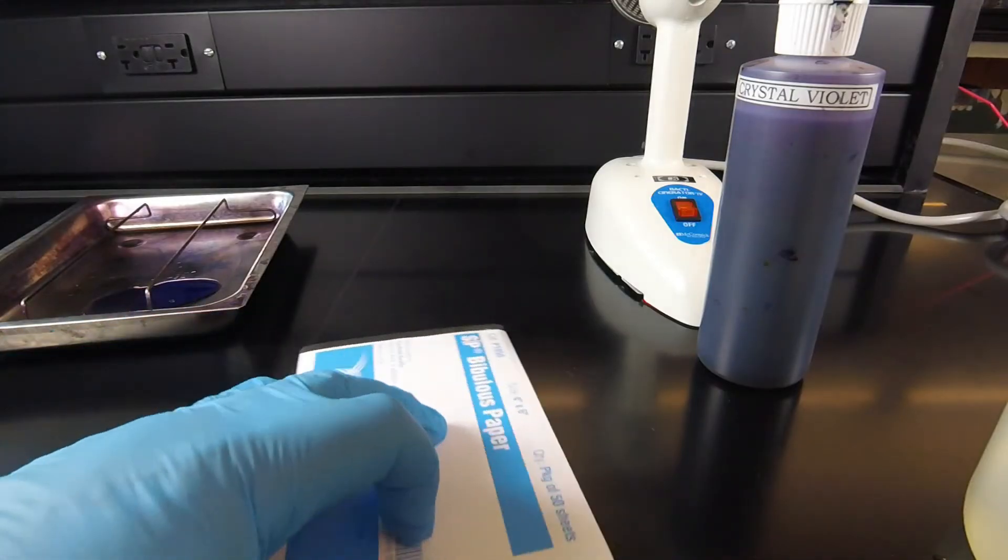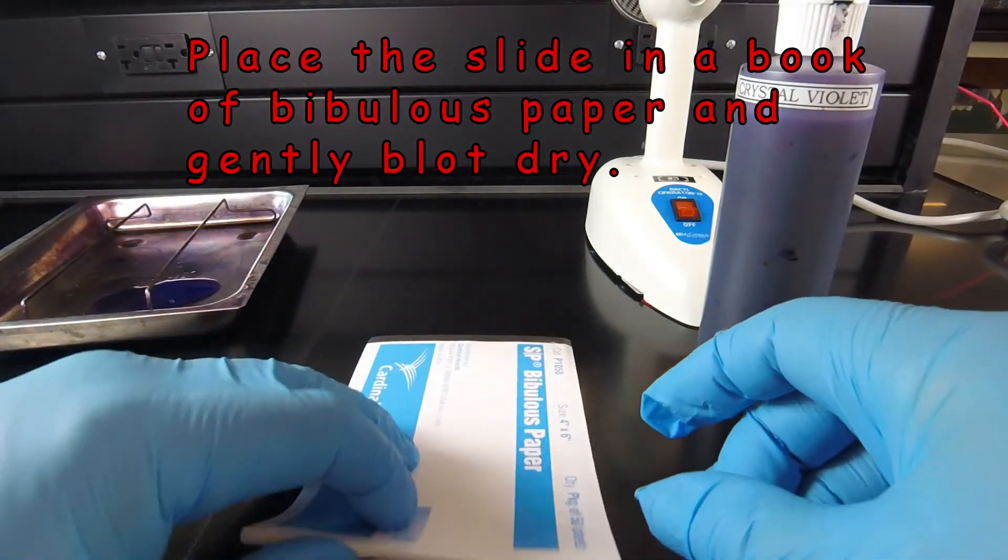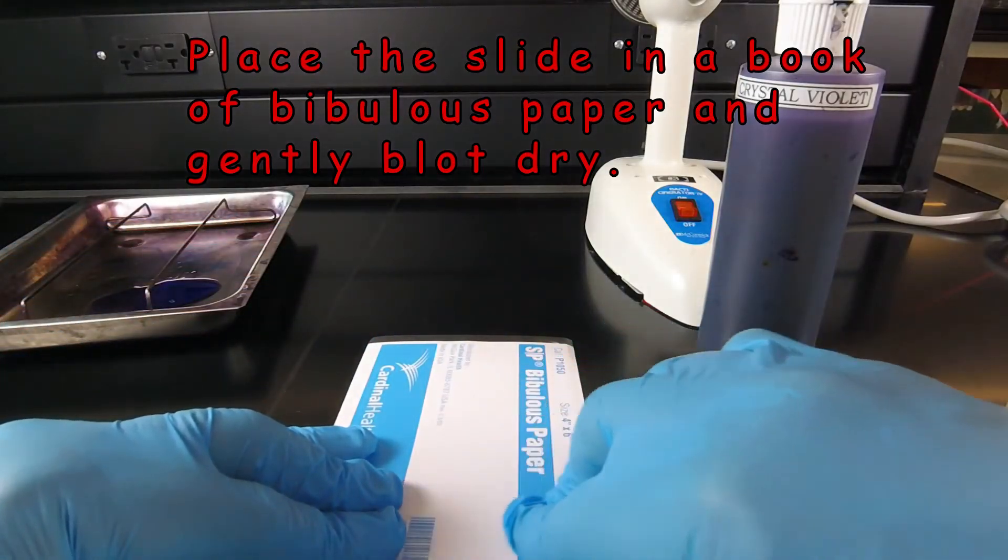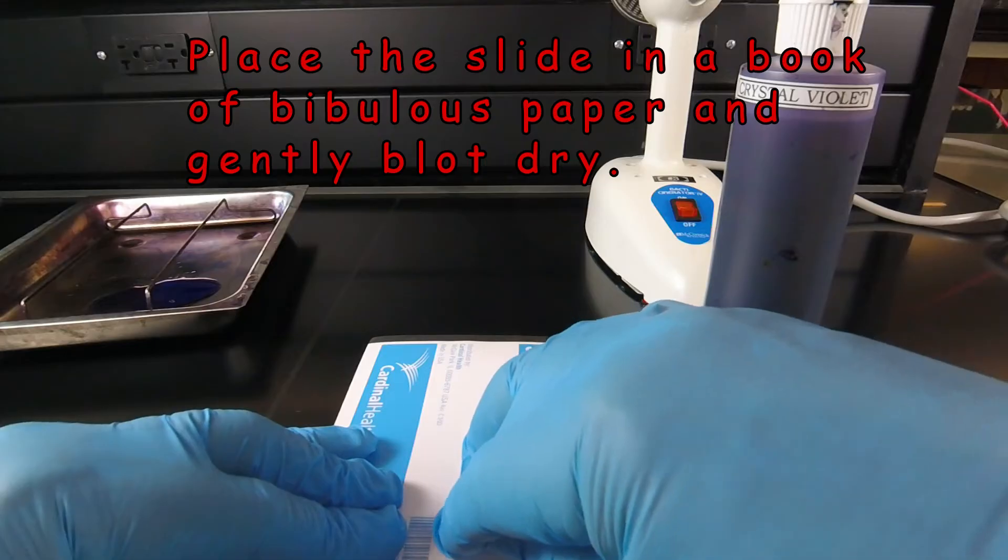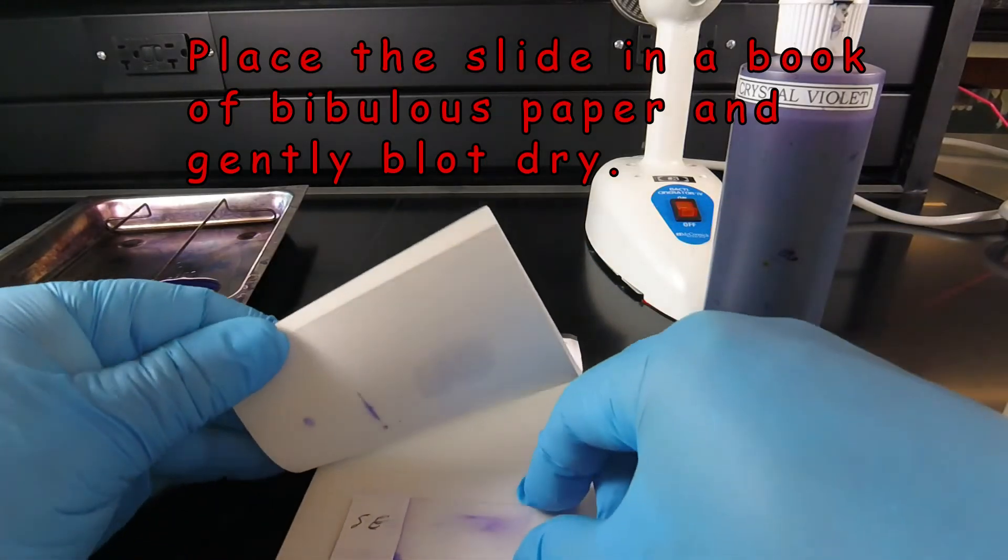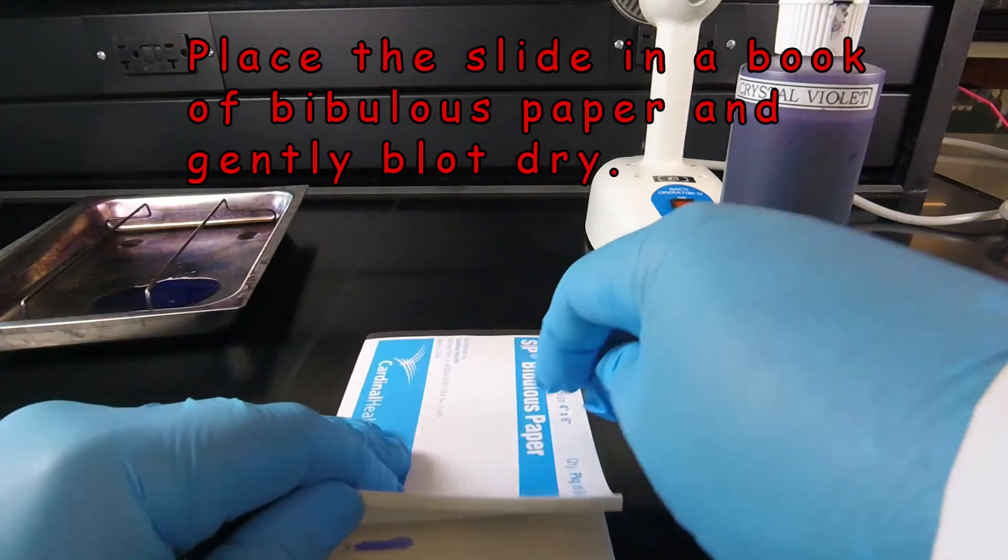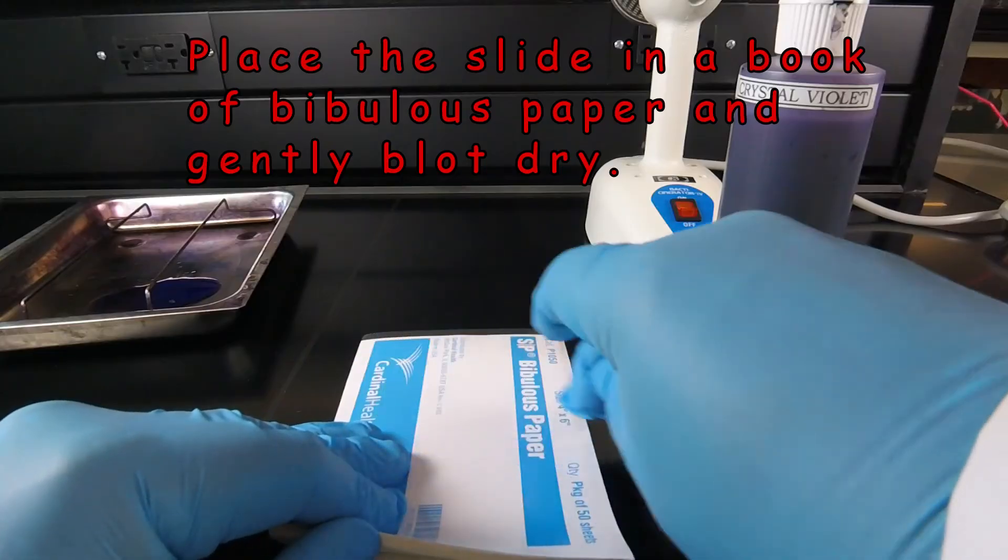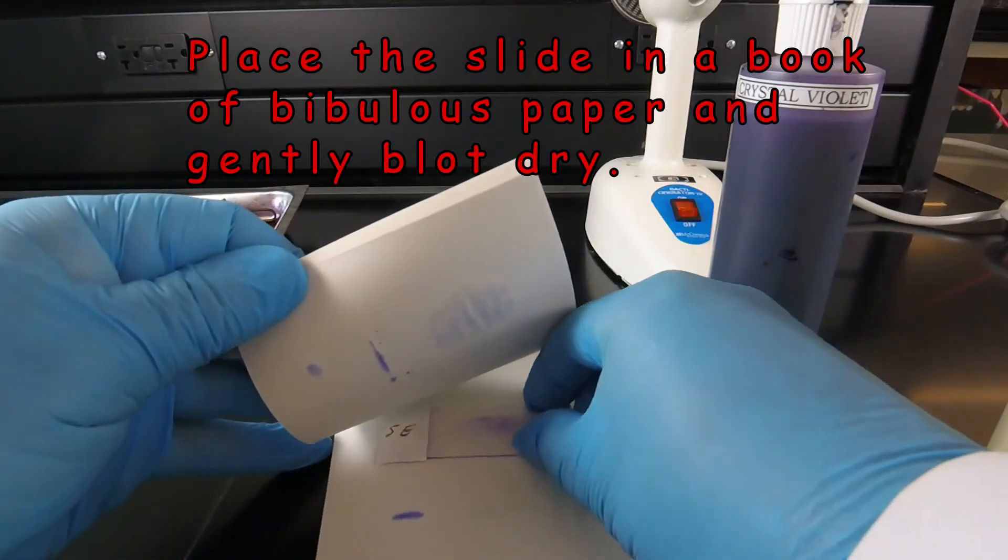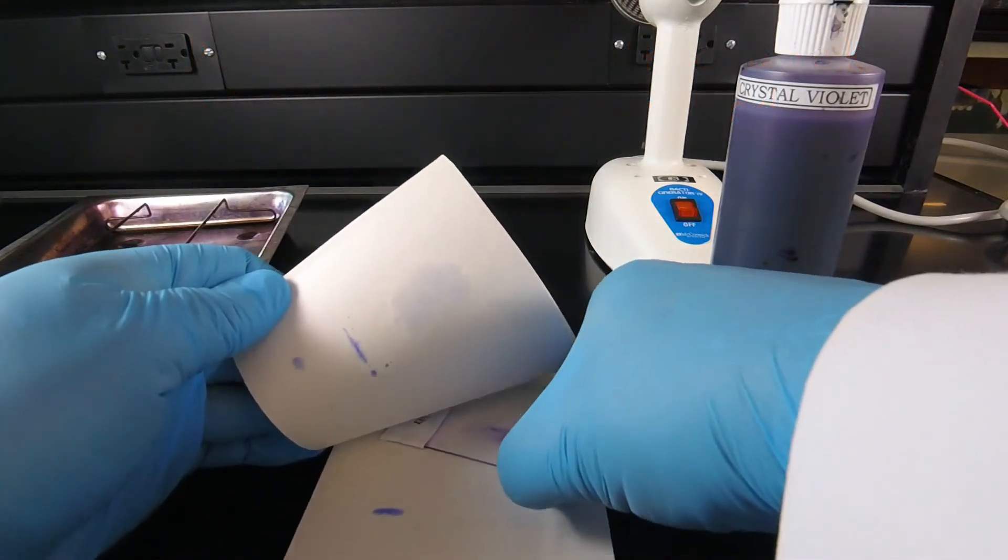For the blotting procedure, we take our slide and set it somewhere in the book. We gently rub the slide, being careful not to push too hard because that can break the glass slide. We're just gently rubbing to blot off the water. We're going to move the slide around several times in the book until we've blotted off all the water.